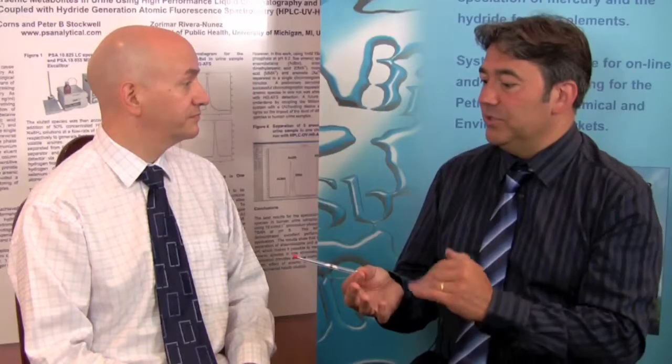The other advantage is that this is very selective. We'll only collect mercury forms, and therefore the measurement is free of any spectral interference. You won't get interference from any other gas species present. For that reason, we can use this in quite complicated gas matrices, for example in mercury in natural gas or in flue gas from a coal-fired power station.